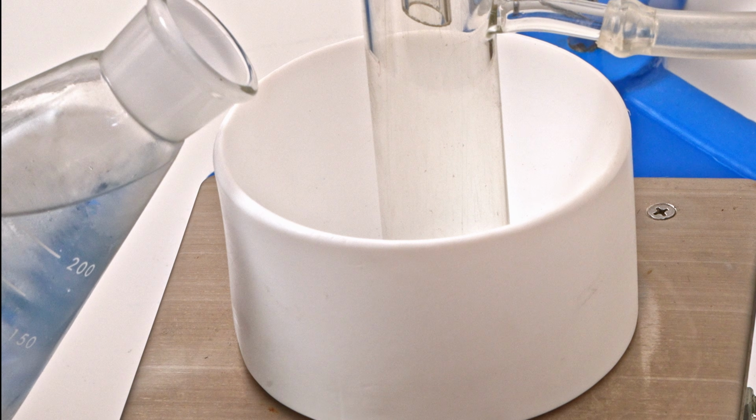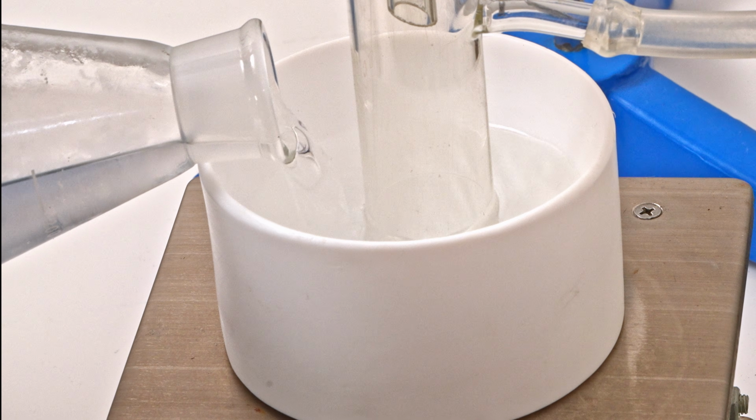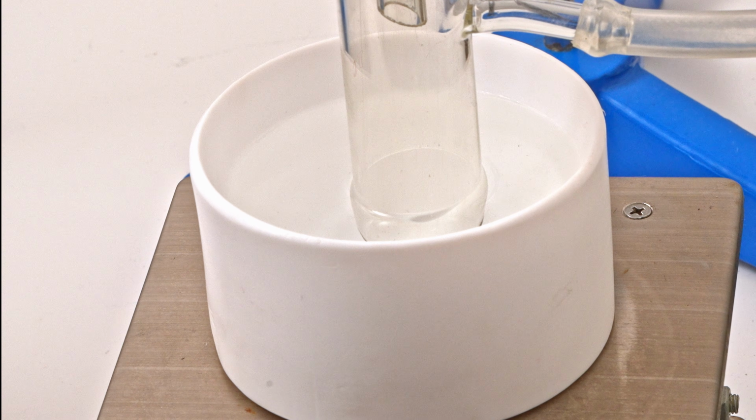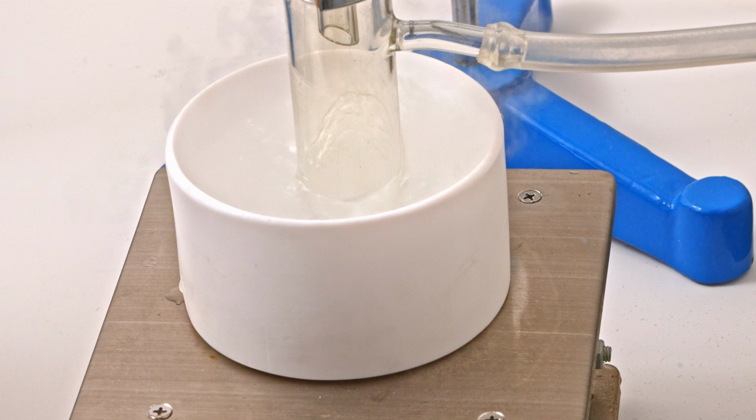And then I'll use a mix of dry ice and acetone to cool down the receiver flask. To do that, I pour some acetone into a Teflon container and then start adding dry ice in small portions, waiting each time for the liquid to stop boiling after each addition.